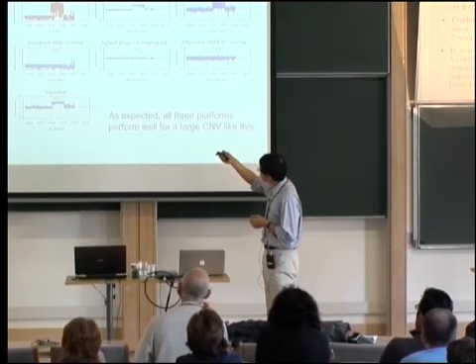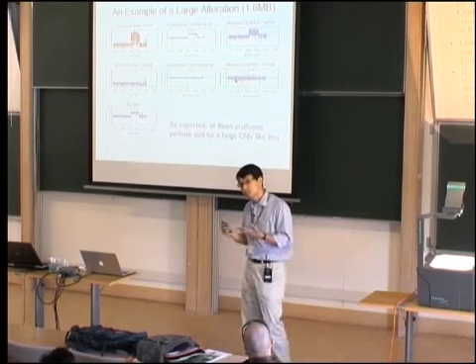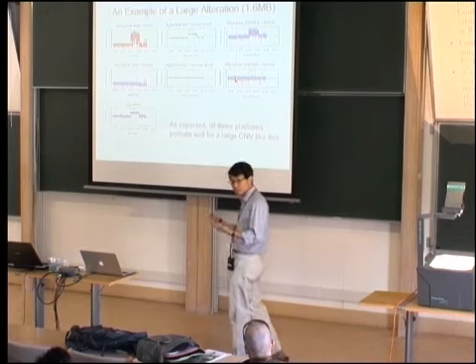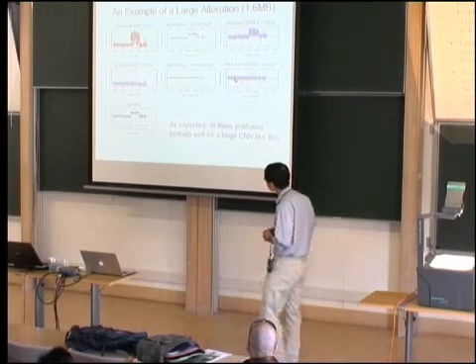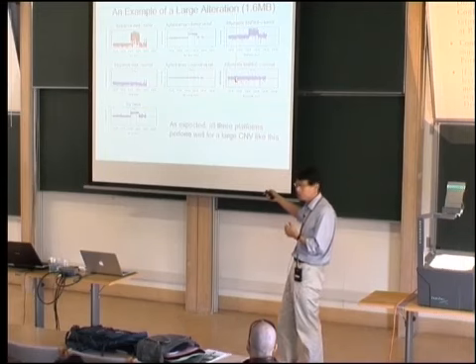Along this chromosome 7, normal sample. So we have matched normal for every tumor sample, usually peripheral blood, because it's very hard to get the normal DNA for a brain. And we look at ratios. Okay? So it's pretty easy to detect here.